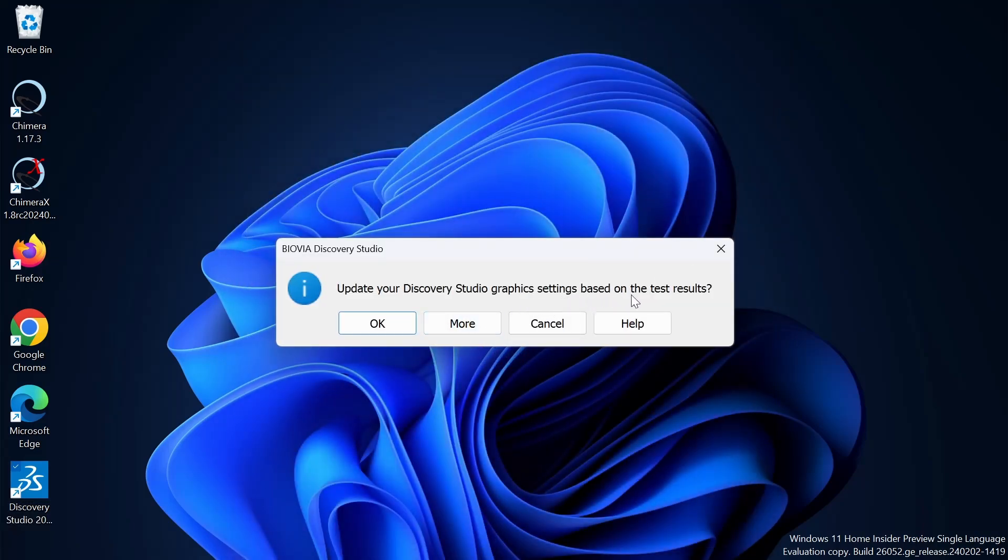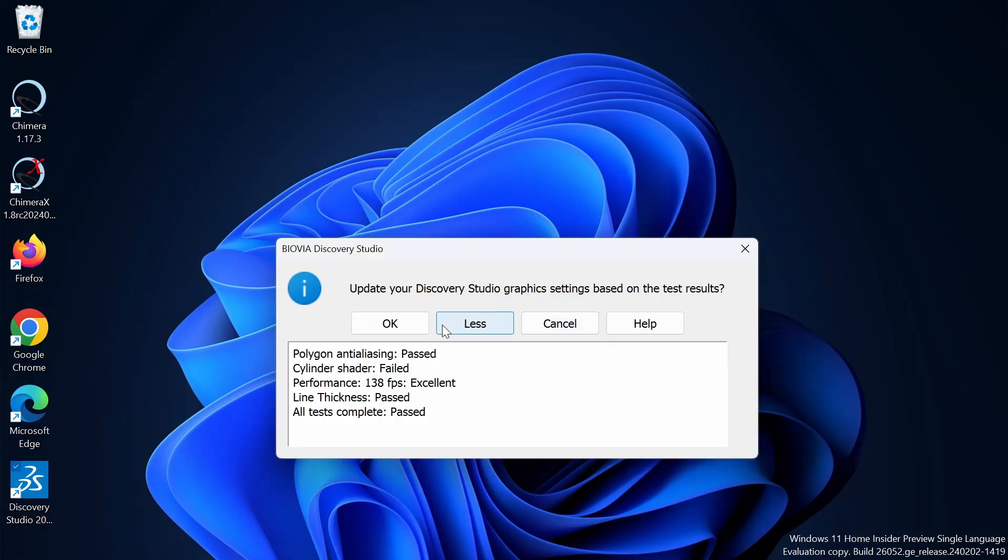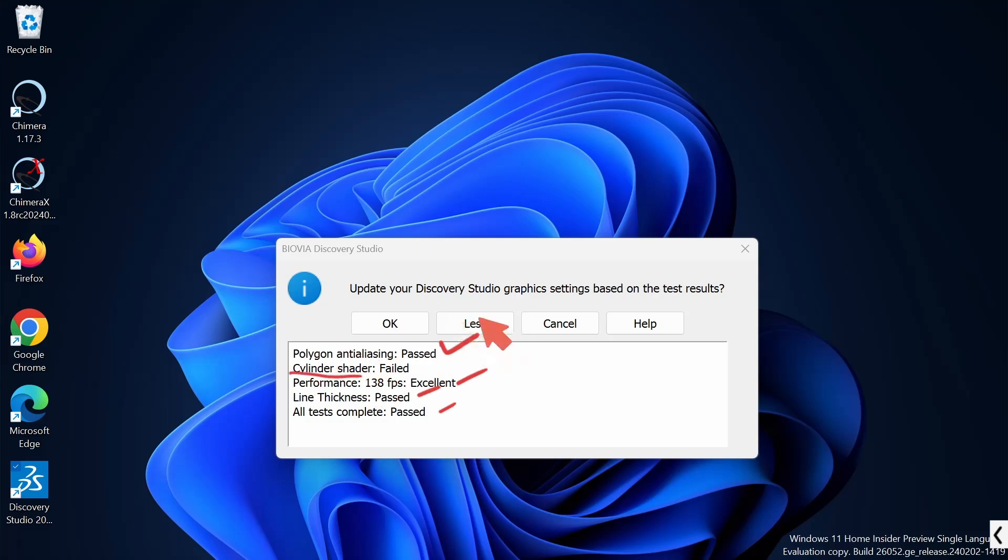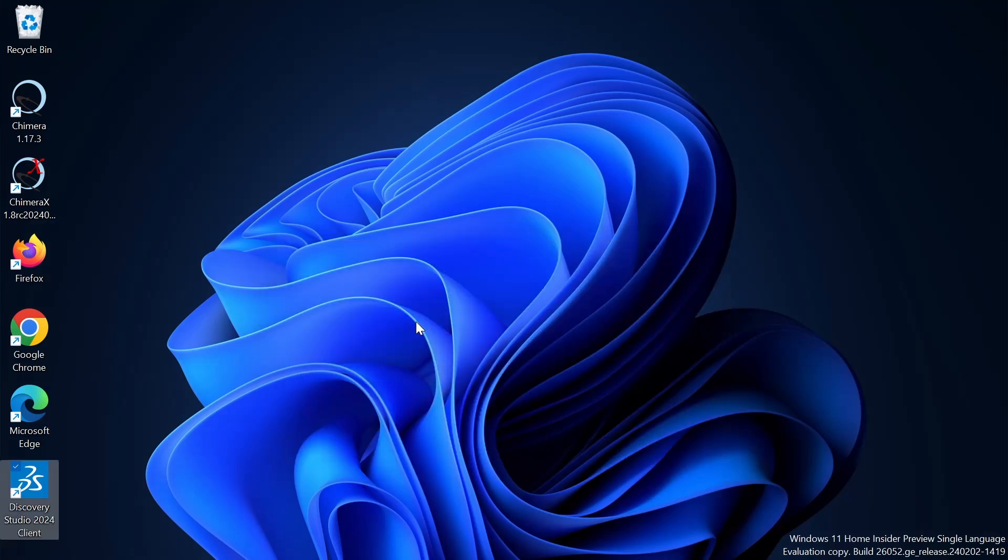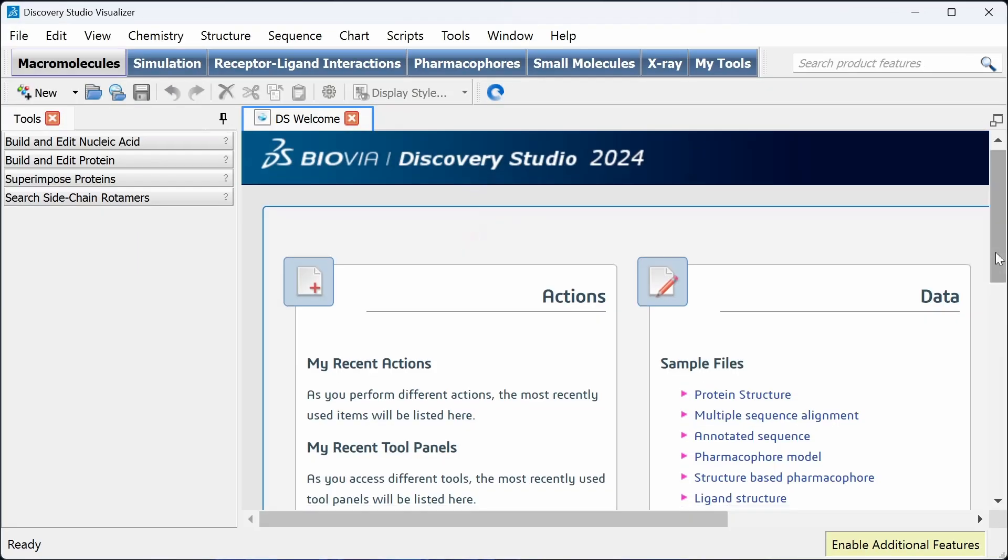The tests are completed and you can just click on more to see the results. You can see polygon anti-aliasing, cylinder shader, performance, line thickness. So that's all, just click on OK.